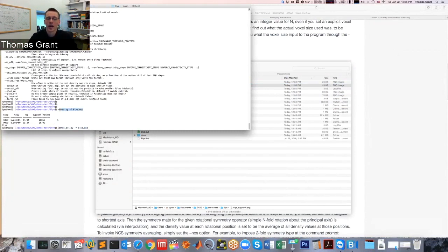If you find that you added a bunch of the parameters for denss.py to get better reconstructions, I recommend that you run a single one, make sure it fits, update parameters however you need to make it fit for one, and then you run the total averaging procedure.